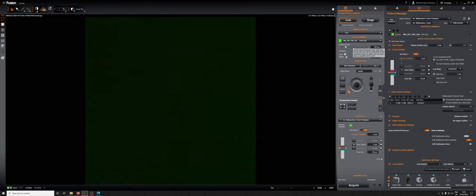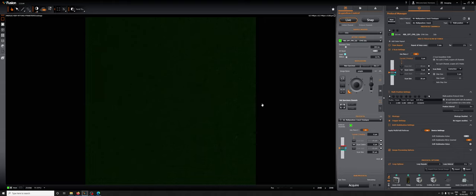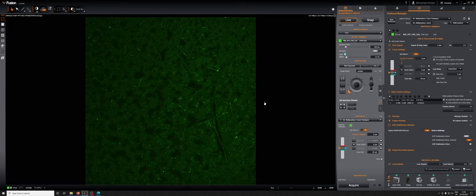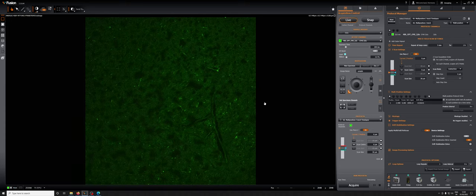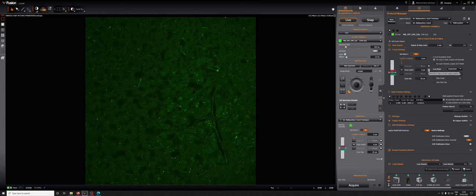Let's say I want to add this position. I've moved to it by using the joystick. I'm going to again focus on this position, which is clearly out of the focal plane, by using the focus knob, not the piezo. I'm going to move the focus knob until I get something in focus. I am going to make sure that the piezo is in the middle if I'm about to add it.